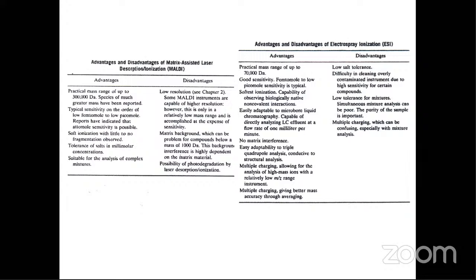It's adaptable. No matrix interference. Multiple charging is a problem, actually. Then low salt tolerance. So if I have salt, this is not a good method to use. It's difficult to clean. Low tolerance for mixtures. So if you have many components, then that's a problem. Multiple charging is a problem.